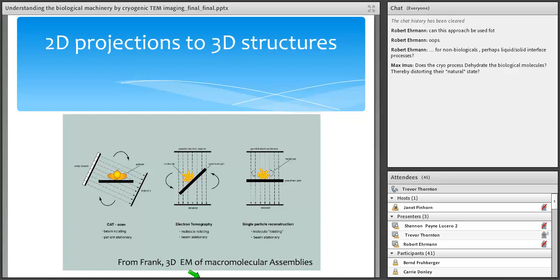For the biological material in the electron microscope, we have two options. We can't rotate an electron microscope because they don't do well in rotation. So instead, we'll rotate the biological material relative to the electron beam. It seems better to do that. Yeah. But there's a problem with that: the table the biological material sits on, the electron microscope grid, gets in the way.